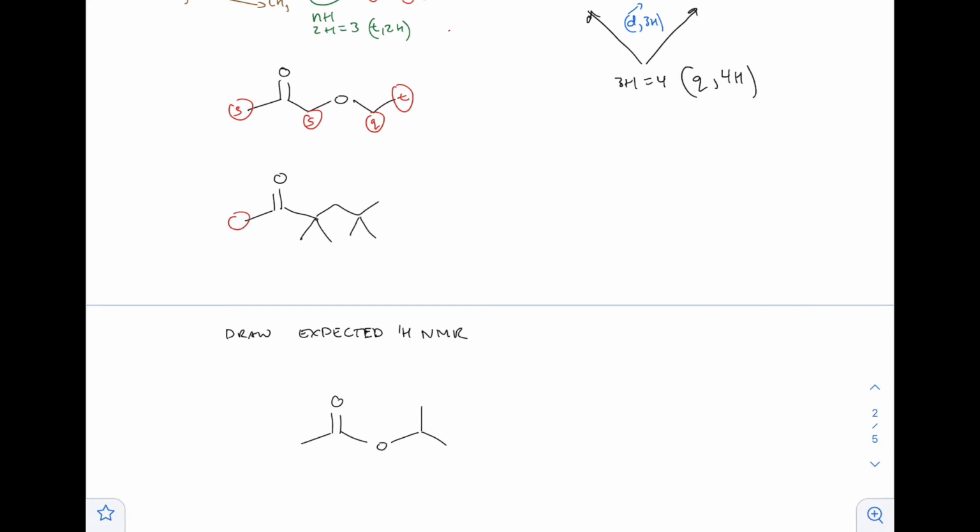So there's 3 here, 3 here, 3 here, 2 here, and then 3 here. Just quickly, there's a singlet there. These don't see anything. They're too far away, so those are also singlets. That is also a singlet, and that should be a singlet too, right?